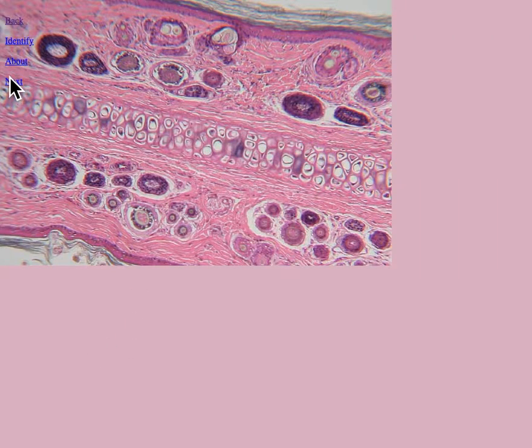Elastic cartilage can distend and recoil, just like elastic connective tissue. But it's thicker and more dense. And so I can see some elastic connective tissue right here. Now, one place where you find this in particular is in your earlobe. And so if you take your ear and you bend it back, it will just snap back to where it was. And so what I have here is I got somebody's ear here.